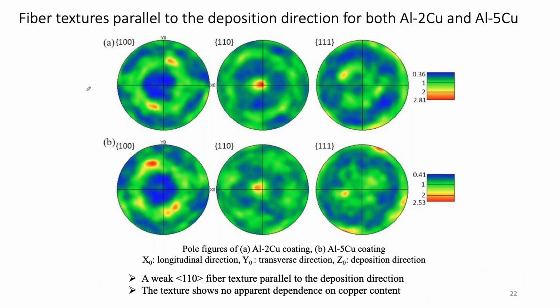We've also seen, and there's really not many results on this in the literature, some evidence for the development of deformation textures from EBSD. Now, to be fair, you could do this in X-ray diffraction or neutron diffraction, and maybe we should. I think those would be better techniques because they're going to average over a whole lot more orientations.